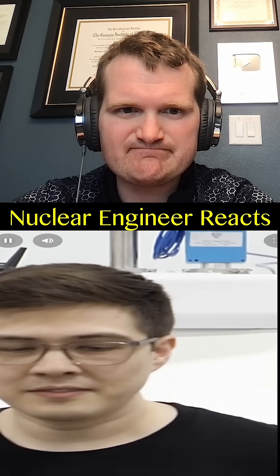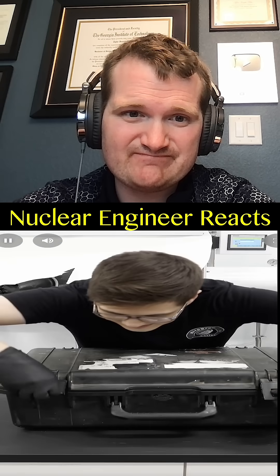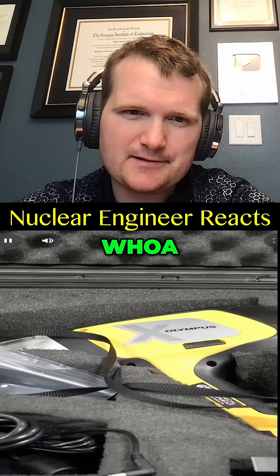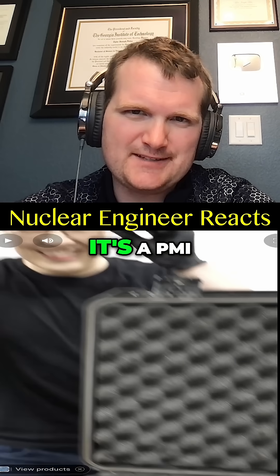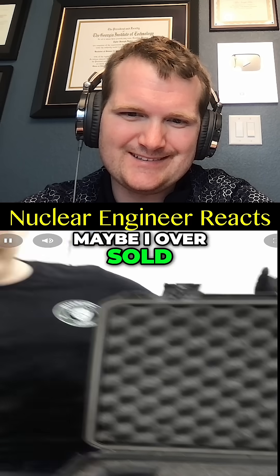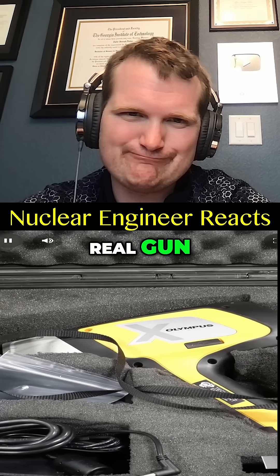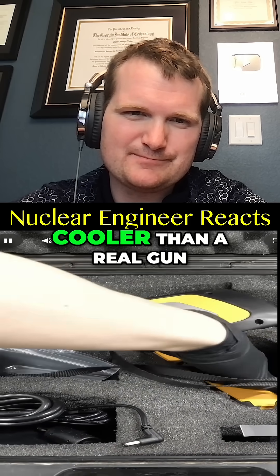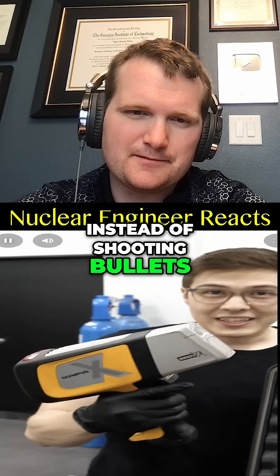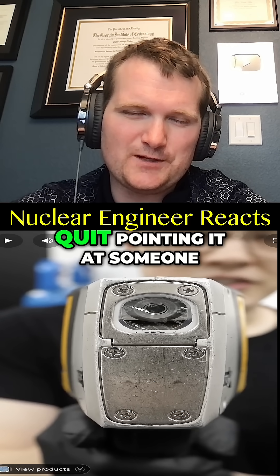I bought a gun — nice — and today I'm gonna use it. What kind? It's a PMI, that's a Positive Material Identifier. Maybe I oversold that a little bit — it's clearly not a real gun, but in my opinion it's actually kind of cooler than a real gun. Instead of shooting bullets, it shoots x-rays, which is why it's — dude, quit pointing it at someone — called an XRF gun.